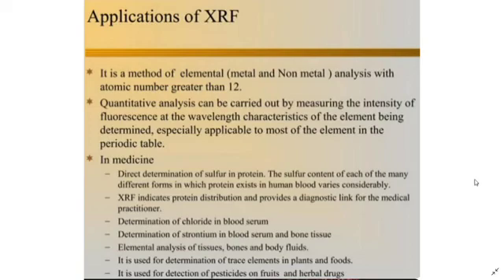So now we know the XPS and XRF techniques. If you ask me what is the difference between XPS and XRF, both methods utilize X-rays, but in different ways, which is why different kinds of information can be obtained from the sample with each one of them. In XPS, the atoms of the sample surface absorb X-rays and emit electrons, but in XRF, the atoms of a sample both absorb and emit X-rays. When the emitted X-rays are analyzed in XRF, the elements present in the whole sample can be identified and their concentration determined.